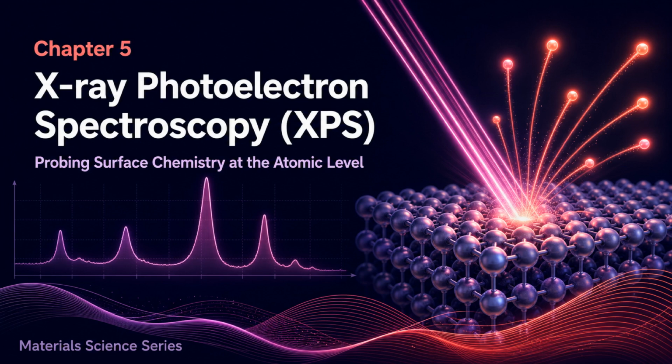Welcome to Chapter 5, where we explore X-ray photoelectron spectroscopy, commonly known as XPS. This powerful surface analysis technique probes the elemental composition and chemical states of materials at the atomic level. By irradiating a sample with X-rays and measuring the kinetic energy of ejected electrons, we can determine binding energies that reveal both what elements are present and their chemical environment. XPS is indispensable in materials science, catalysis research, and thin film characterization.